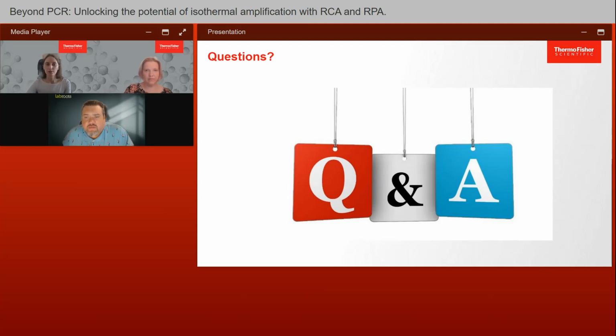And if you are performing MDA reaction without any purification, but you have problems with it, I would suggest you purify the samples as a troubleshooting step, because maybe you have inhibitory components in your reaction, and this can help eliminate that and improve your success of MDA reaction. But in general, it is not required to purify your DNA samples.